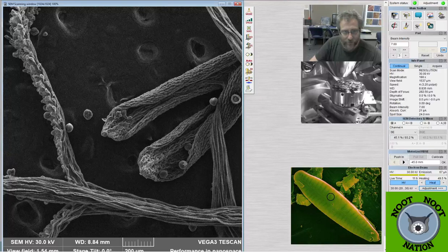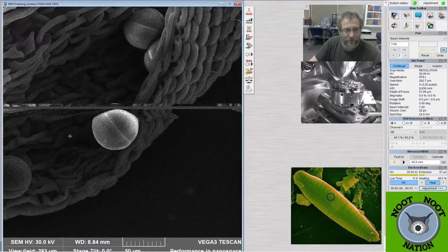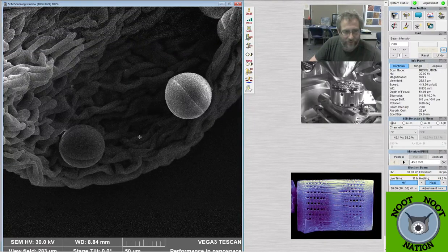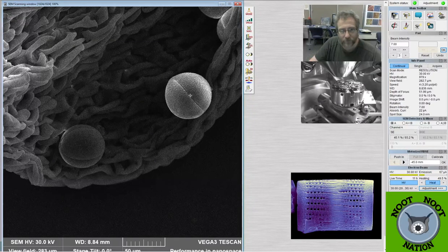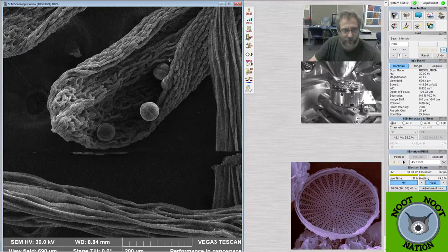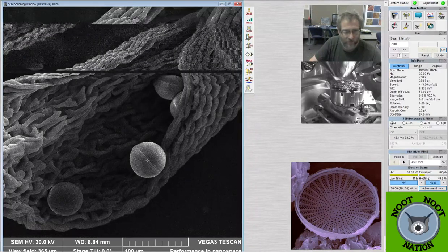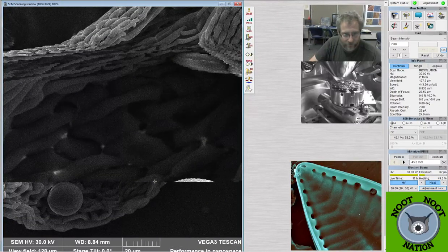Yeah, look at these cool pollen grains on here. These ones are like beach balls compared to those other ones, aren't they? This only has two slits, but I think this one has three. Or maybe that's just one long slit that we're seeing, actually. I thought maybe I was looking at it end on. But they're like beach balls, and they're huge. Oop, it's charged up a little, because we're right on the edge of it.